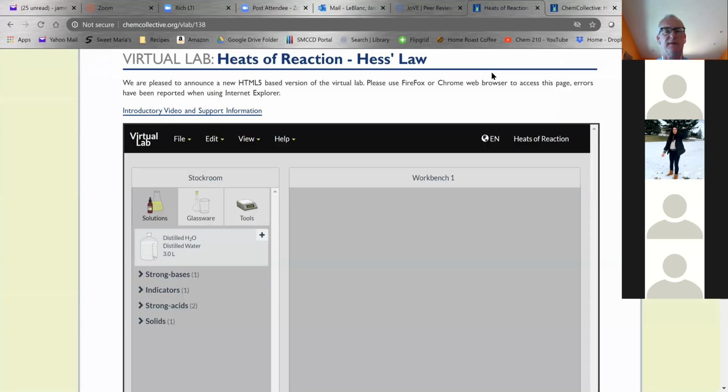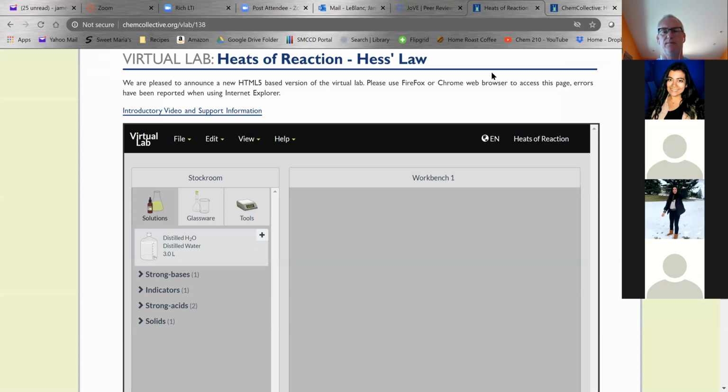All right, do you see the screen for heats of reaction? Yes. Okay, good. All right, so let's look at our procedure.